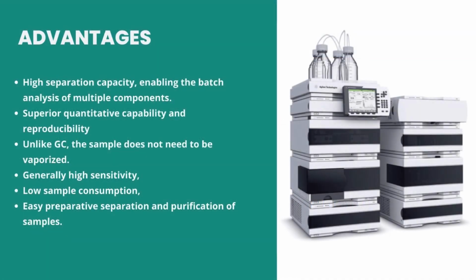If we can see here, these are the bottles of the solvent reservoir. There are 4 bottles. In case of isocratic elution, all bottles will contain the same solvent. Whereas in case of gradient elution, we usually mix the ratios. For example, if we want to use 3 parts of water and 1 part of methanol, we will fill 1 bottle with methanol and 3 bottles with water.